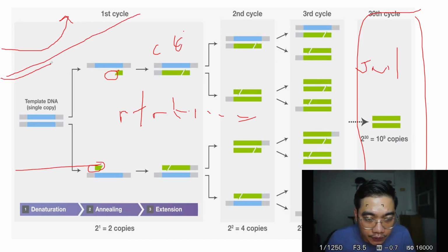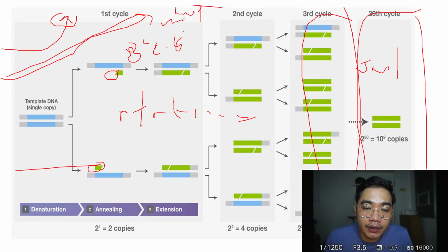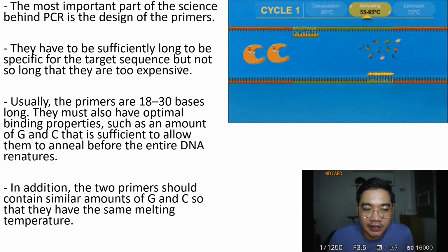So we can check if there is an increase in amplification because there are, like I said, fluorophores that we can detect. If there is an increase in the total target gene concentration, most probably you have that virus, an actively dividing virus or some viral particles in your nose. That's why you are tested PCR positive. Okay? So that's the basic gist of PCR.